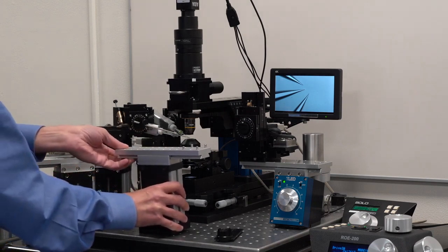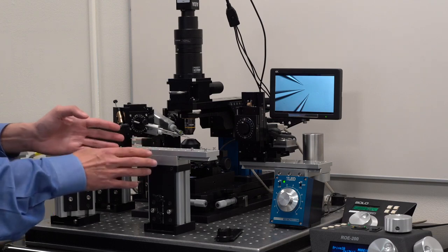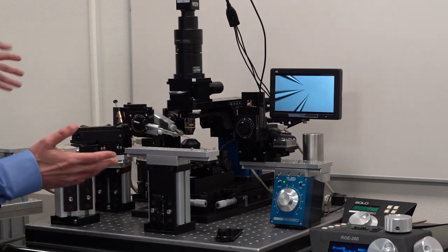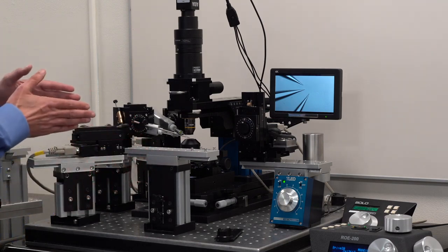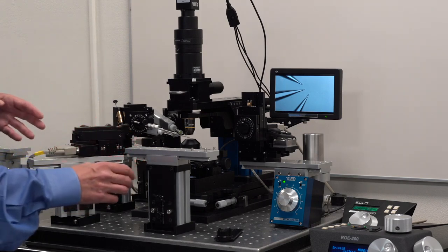Because we have made the narrow format manipulator, we have also made the narrow format stand. It would be crazy to put the narrow format manipulators on a regular format stand.